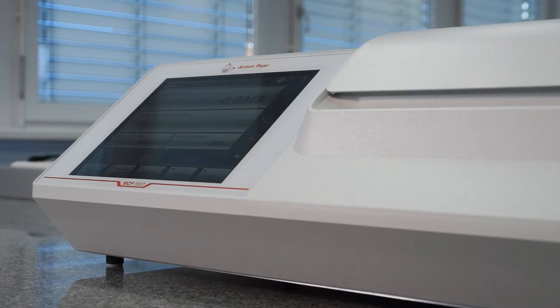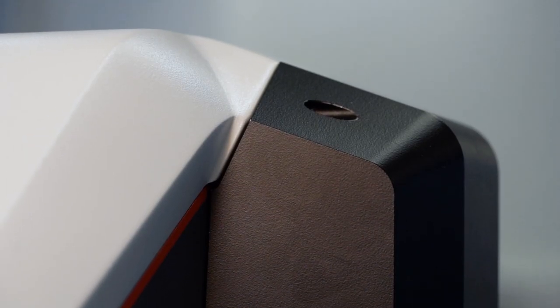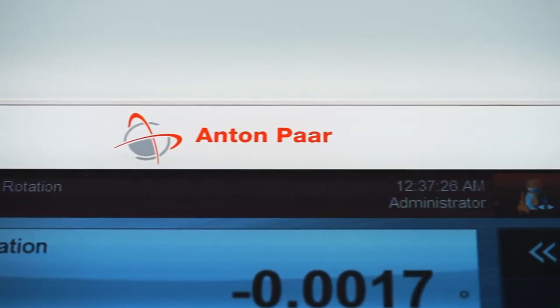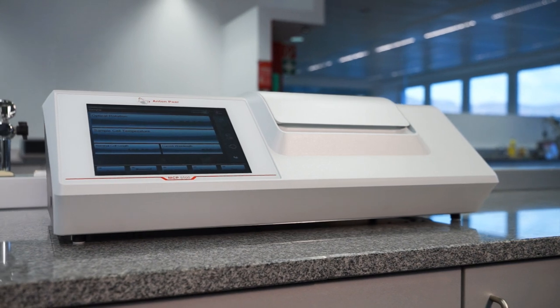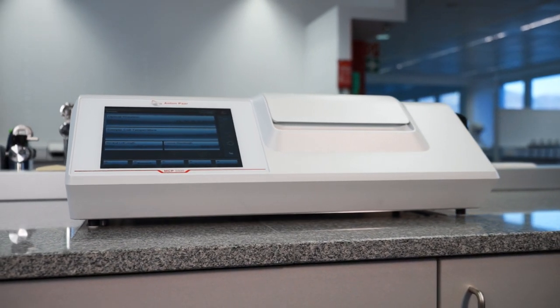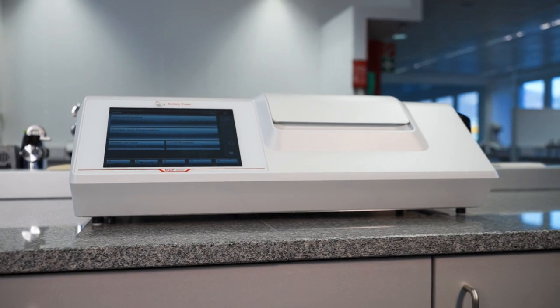Anton Paar has over 40 years of experience in developing and producing polarimeters. From research and development to production and quality assurance, you can count on solutions from Anton Paar. The new MCP polarimeter series combines state-of-the-art technology, excellent usability, and modern design.